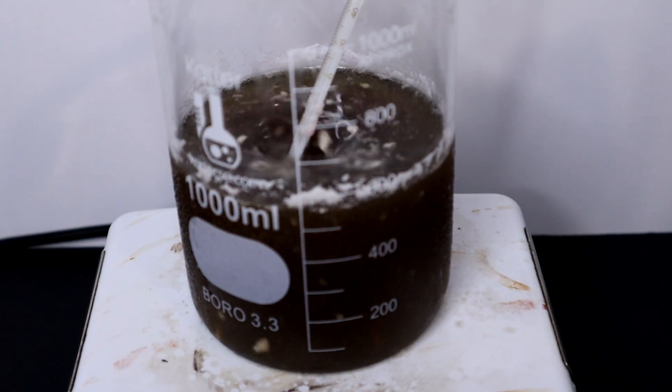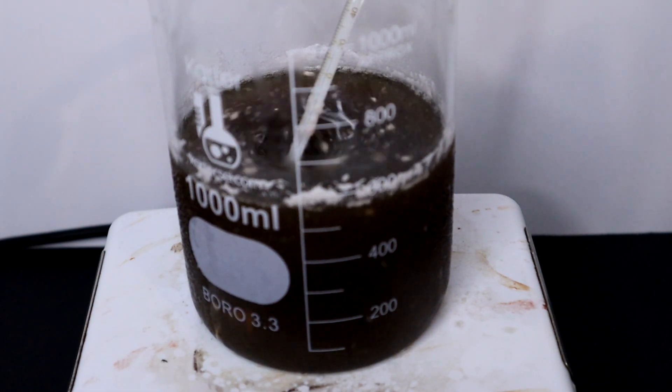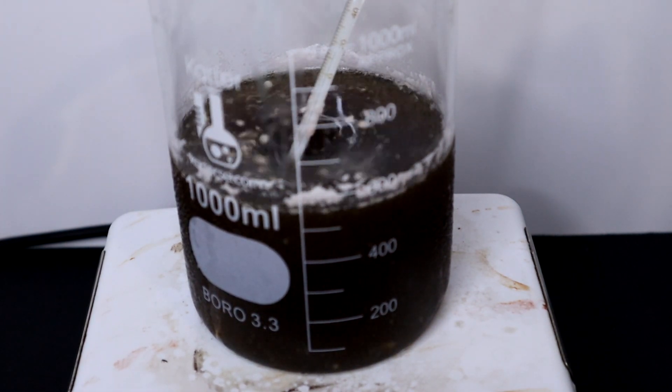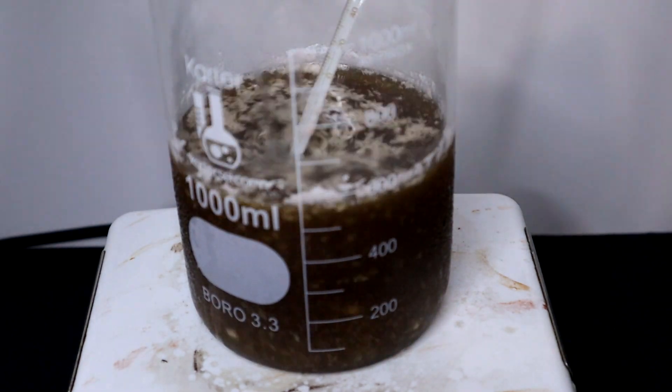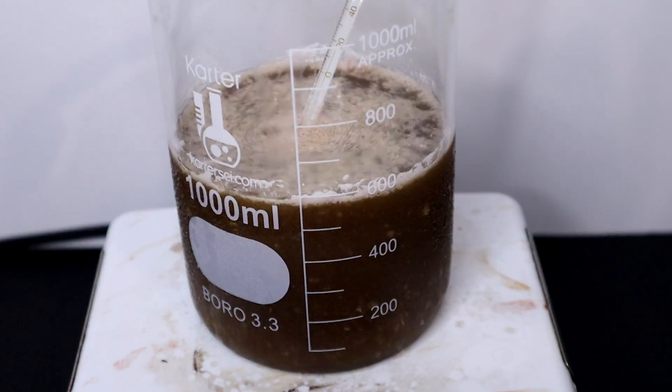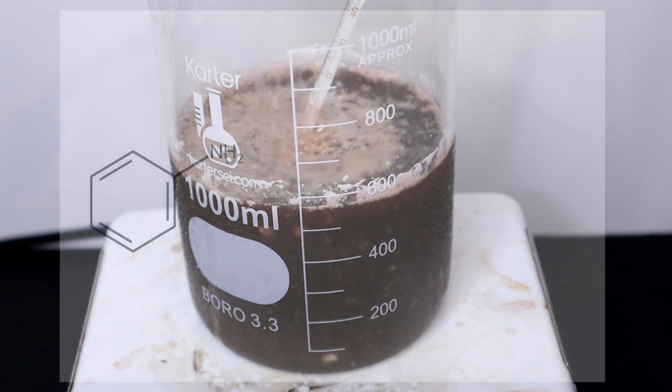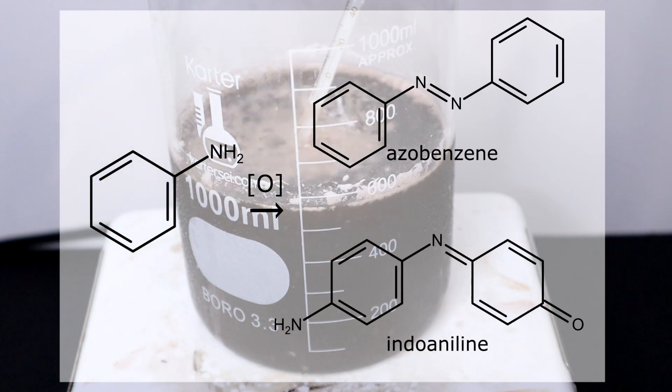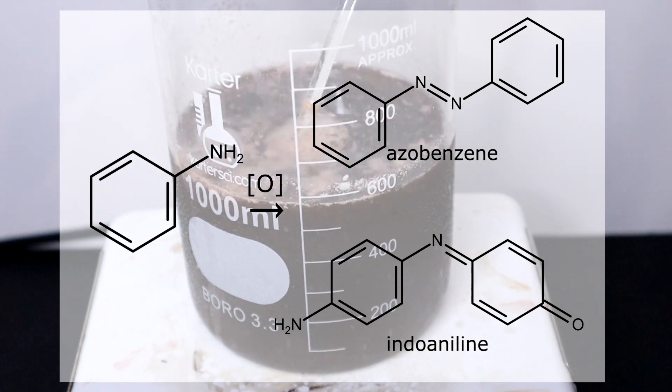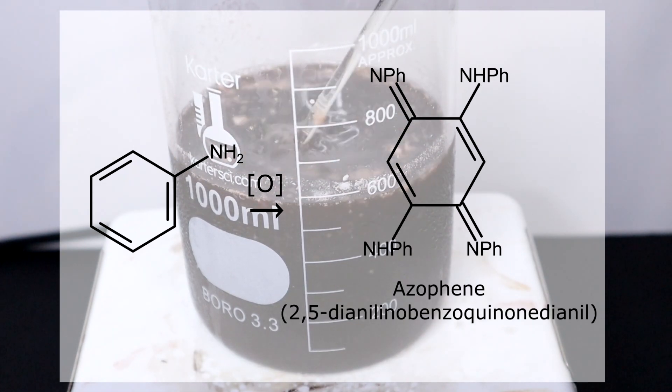Over the course of my additions the solution slowly turns darker and darker. This is due to several other side reactions which are occurring. Aniline unfortunately is quite sensitive to oxidation and hypochlorite is an oxidant. Under these alkaline conditions aniline can undergo various side reactions forming compounds such as azobenzene and nitroaniline, parahydroxyazobenzene, 4-anilineazobenzene and even more interesting compounds such as azophenine and some polymers of aniline.